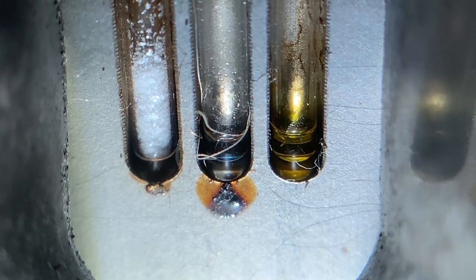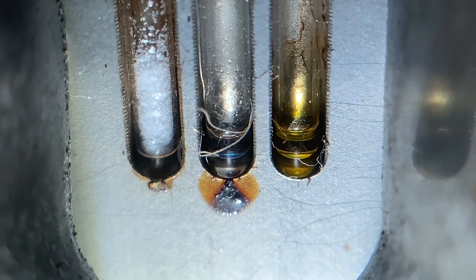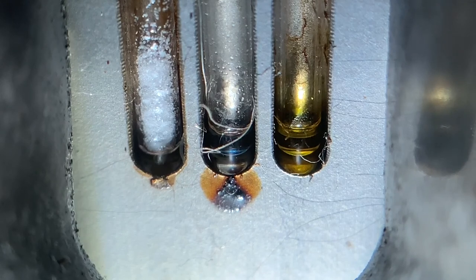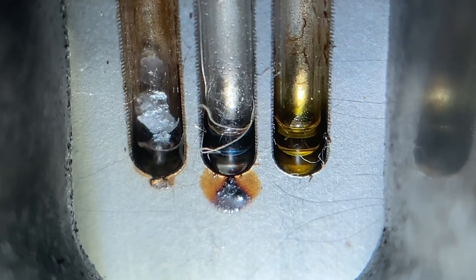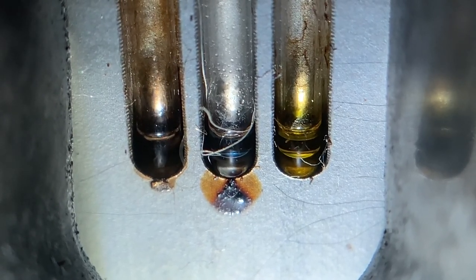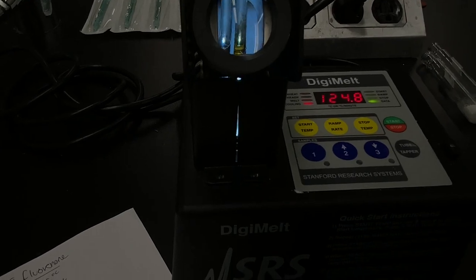Expect to see benzoic acid melting soon. We're at 115 and its literature melting point is 122. It's at 119. That's 120. Should start soon. There we go. Okay, so 121. And it's all gone at 122. That matches the expected literature. Okay, we can shut it off now. I think we have to retake 9-fluorenone.